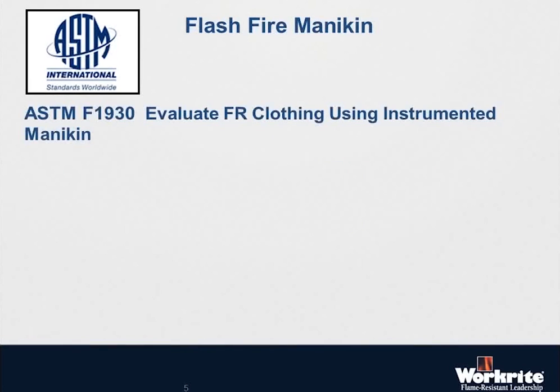The next test method is the flash fire mannequin test. This is one that if you're in the hazard zone where you're going to have potential for a flash fire from a flammable vapor, gas, or combustible dust, this is a test that's critical to be run, and one that's a pretty famous one. And it's primarily only used in NFPA 2112, the flash fire fabric garment standard. And it's a test that's run in live conditions with flames. It's not a flash fire, but it generates the type of thermal exposure that is expected.